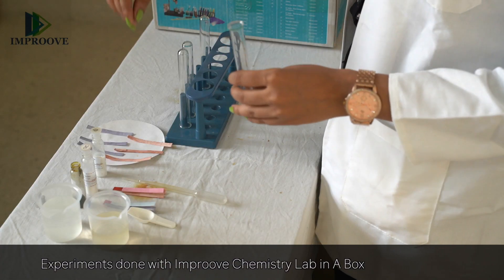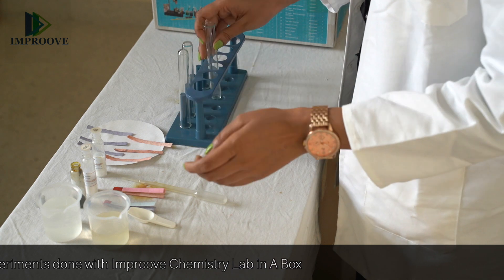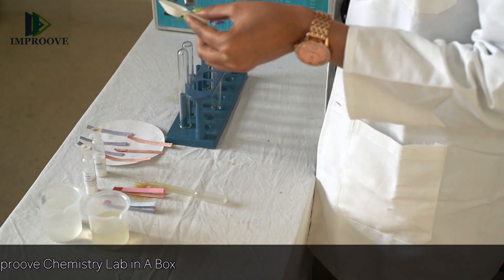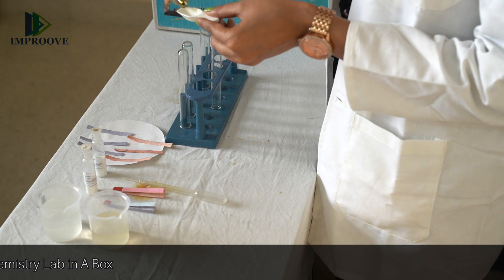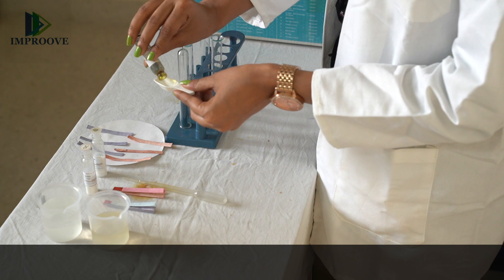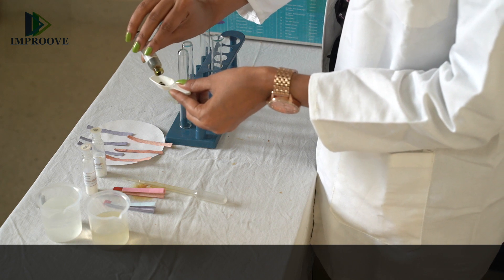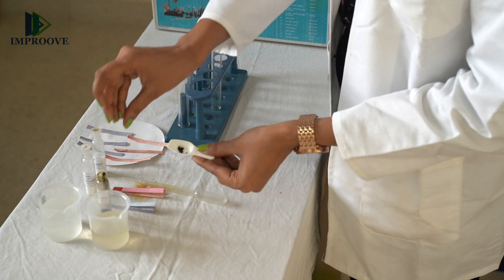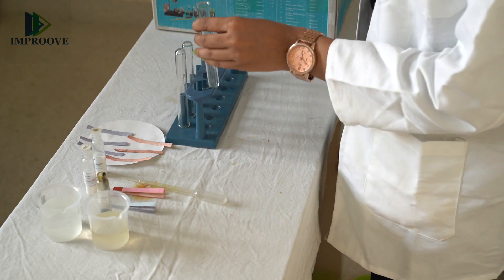In the first step, take a test tube and add about 0.5 grams of ferric chloride using the spoon, just about this much, and pour it into the test tube.